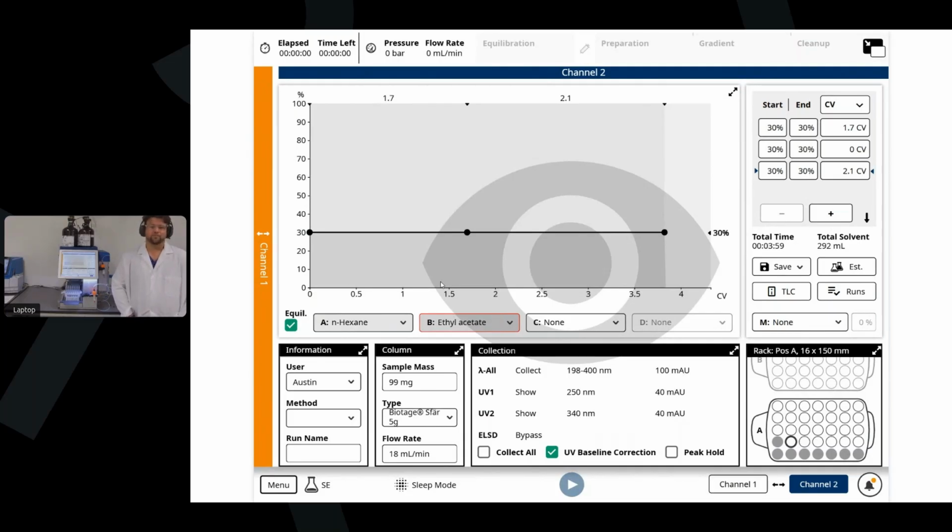how does the Selekt perform with compounds that have weak UV absorbance, such as saturated heterocycles or linker intermediates? Depending on if they have any UV absorption, you should be able to see where that absorbs based on the spectra analysis. But that is why we have the ELSD module as an option, because typically you are not able to see those, especially using the gradient with ethyl acetate hexanes. So I definitely recommend utilizing the ELSD in those cases, but it is able to handle that just fine.